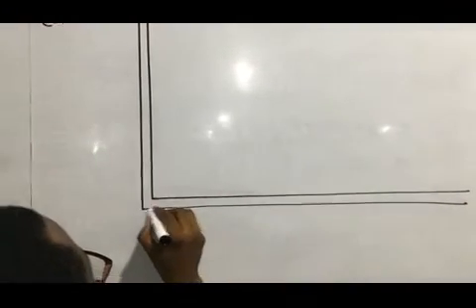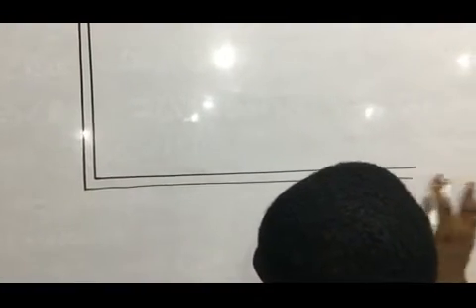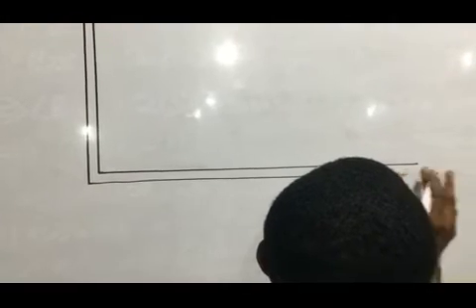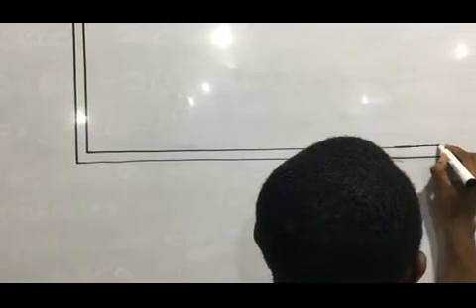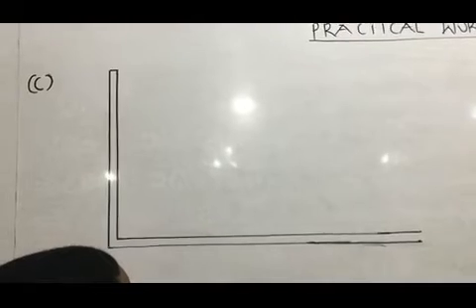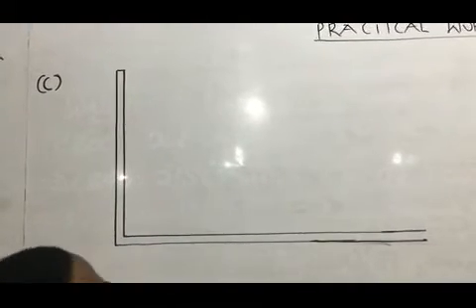In drawing this, I advise that you make use of your rule in drawing so that you have a neat diagram. Don't just use your free hand in drawing. So make sure you make use of the rule and draw your diagram. Okay.